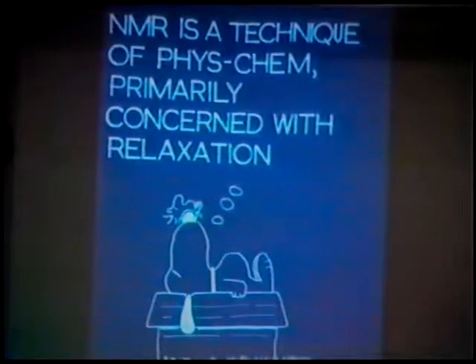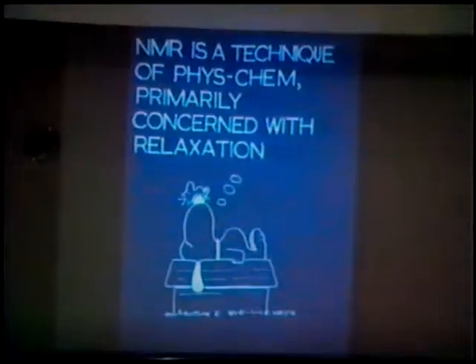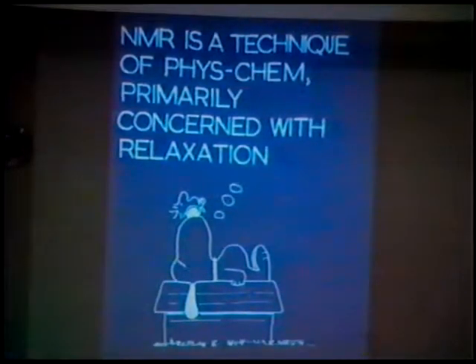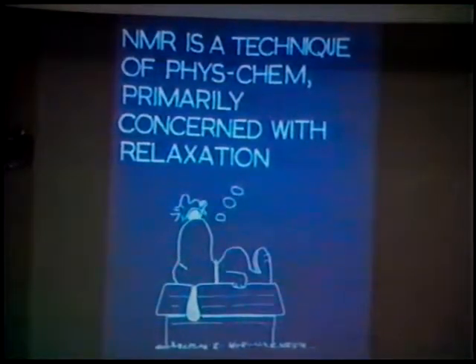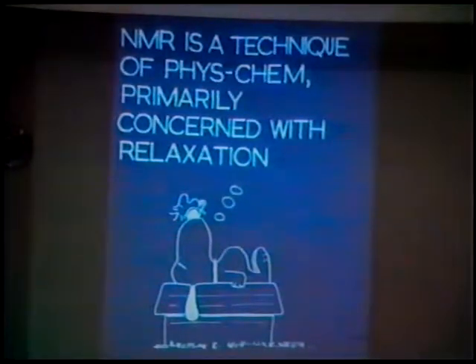Now, a bit about NMR. The basis of NMR is the NMR relaxation times. And although in this particular experiment we don't need to measure the relaxation times or estimate what they mean, the systems are subject to the constraints of the relaxation times because these determine the timescales over which we can make NMR diffusion measurements. So relaxation is at the bottom of this, even though we don't use it too much.